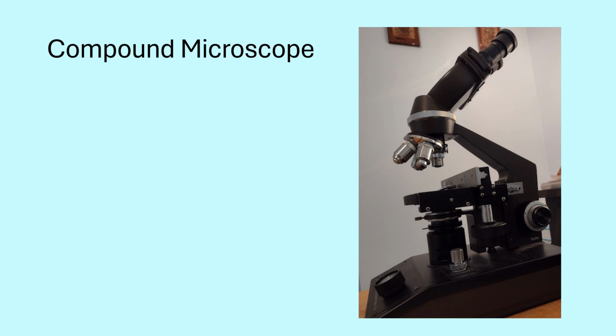From that point on, you're going to be fairly close, because remember that working distance between the objective lens and where the specimen slide is, that's going to start decreasing as you increase the objective lens, increase that magnification. And so use just your fine focus, because you're starting to get pretty close to the slide. You should still see it, just use that fine focus to get it nice and clearly focused. Switch to the next objective lens.